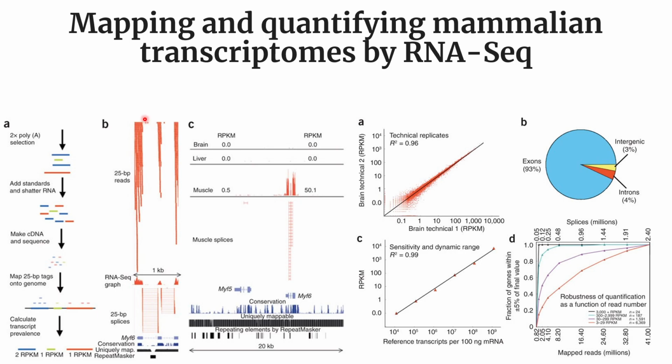So this indicates that in this mouse model, the genes that belong to this sequencing range are more abundant compared to the genes that belong to the middle range of this RNA-seq.